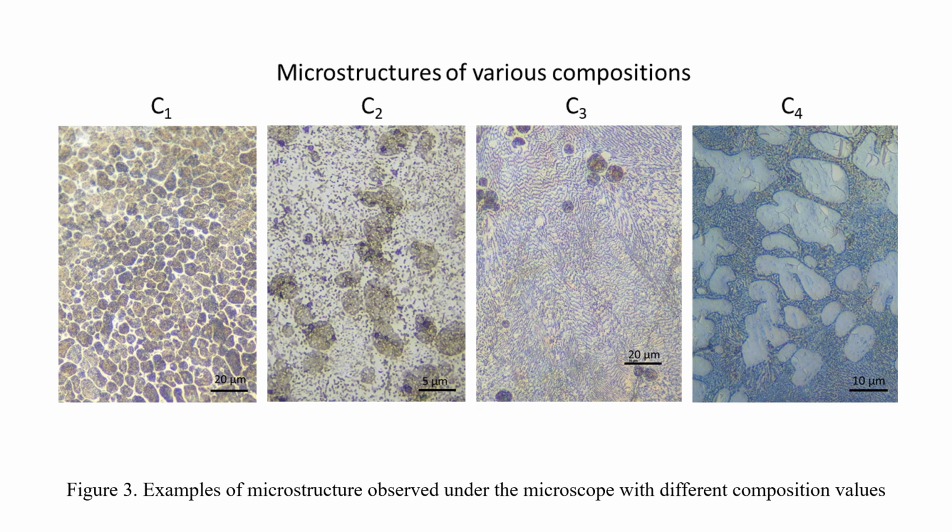In this experiment, samples are polished and then etched in order to observe the microstructure of the alloy. As the alpha phase tends to be more reactive than the beta phase, it reflects less light under the microscope. The dark phase in the microscope images is likely to be the alpha phase, and the bright phase is the beta phase.